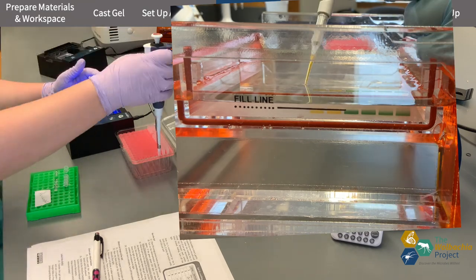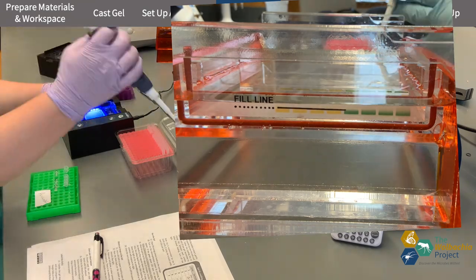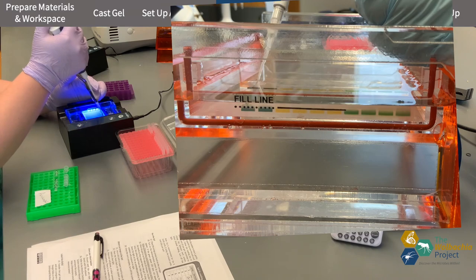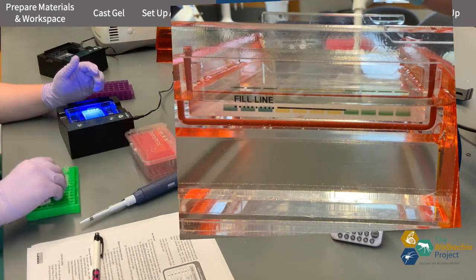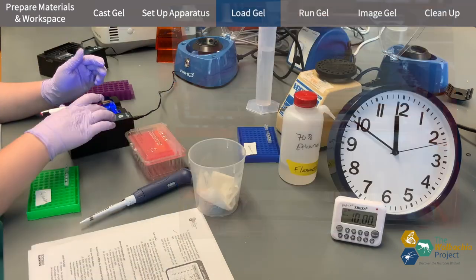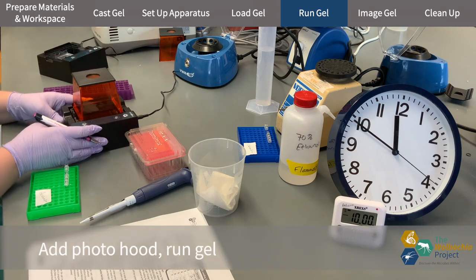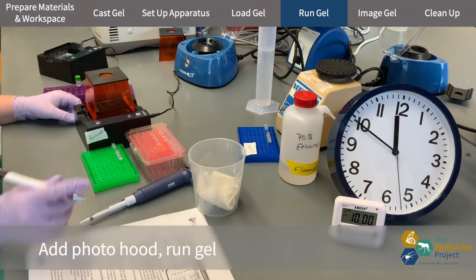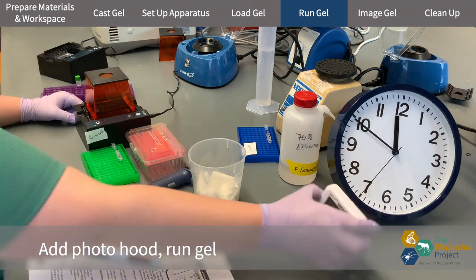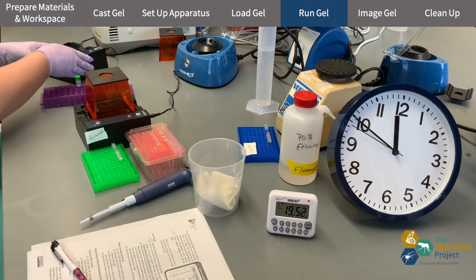You can see I steady my pipette when I pipette samples into a gel. I add the orange photo hood on top of the entire apparatus and press the on button. I let my gel run for about 20 minutes and I occasionally check on it.